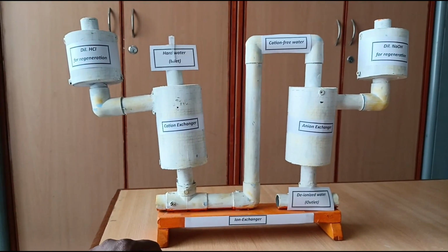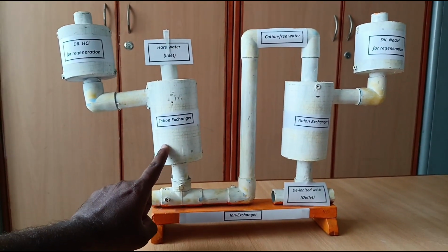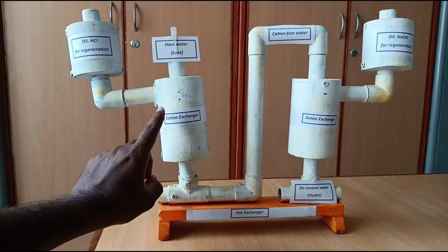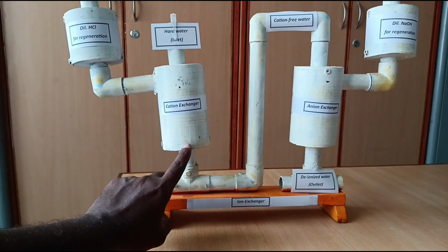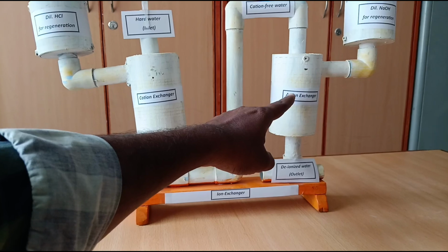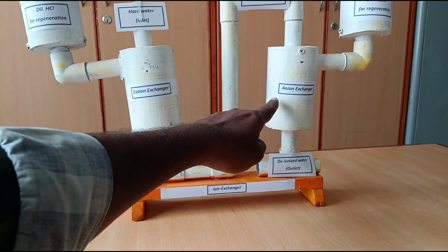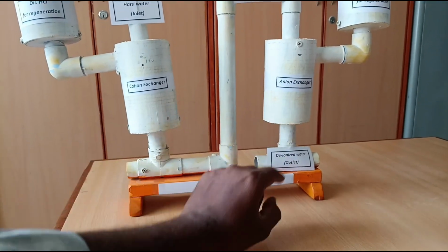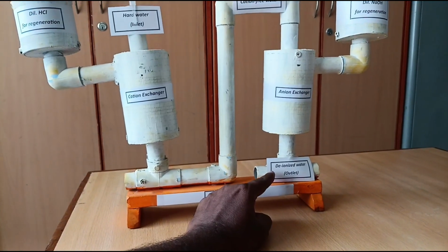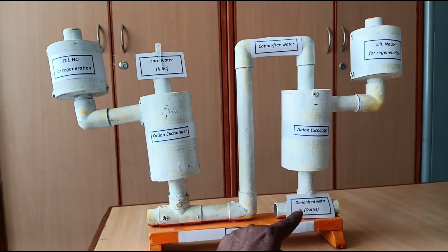Once again, I will repeat the concept. When the hard water is passed through this cation exchanger column, all the cations are absorbed by cation exchange resin, which is present inside this column. Then the cation free water is allowed to pass through this anion exchanger column, where all the anions are absorbed by anion exchange resin, which is present inside this anion exchanger column. The outcoming water is completely free from both cations and anions, and that water is called deionized water.